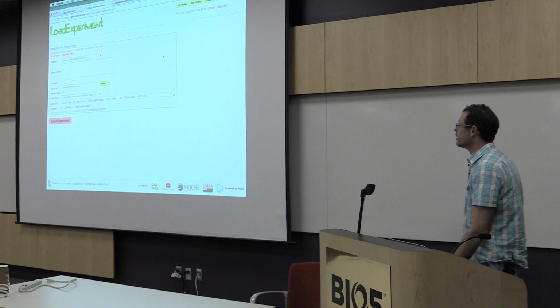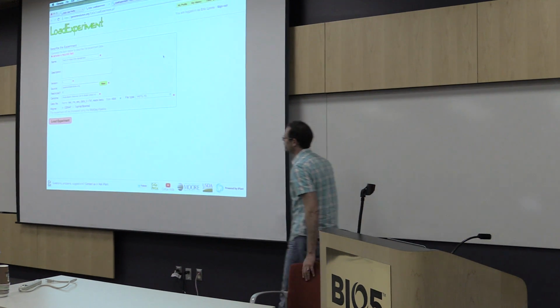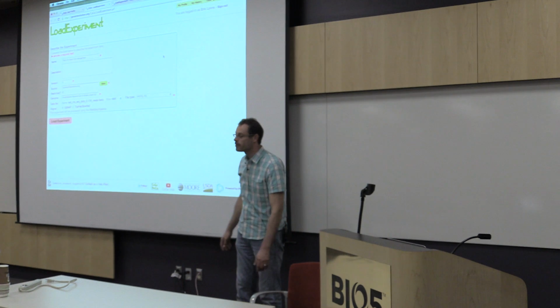You can go ahead and do it. So go ahead and add that file. It's uncompressed. It's about 45 megs.